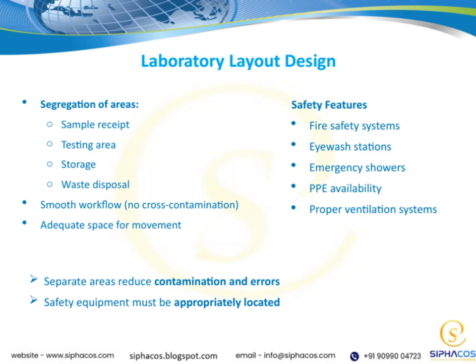Moving on to the overall laboratory layout design, it's important to think about the segregation of areas. We should have separate zones for sample receipt, testing, storage, and waste disposal. This organization not only improves safety, but also streamlines workflow. A smooth workflow is vital. When designed correctly, it prevents cross-contamination and allows for efficient movement within the lab. Additionally, providing adequate space for personnel to move freely is crucial. It reduces accidents and helps maintain a safe, productive environment. Overall, thoughtful layout and safety considerations are fundamental to running an effective and secure laboratory.